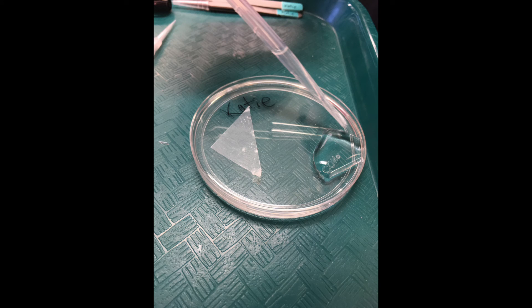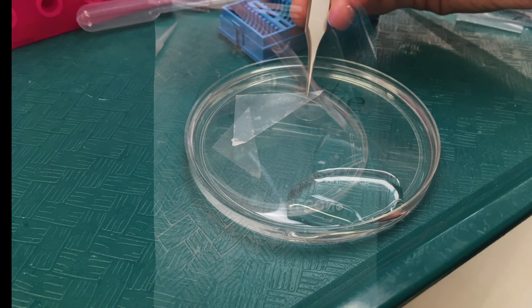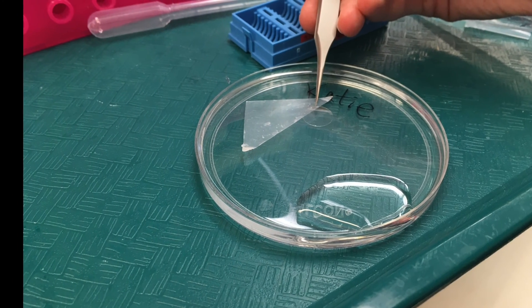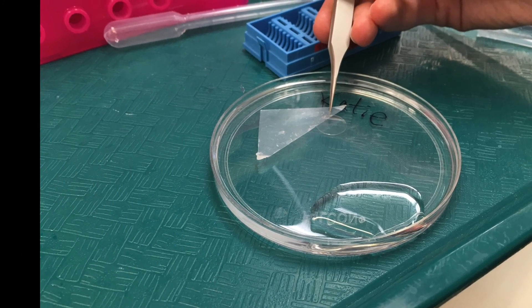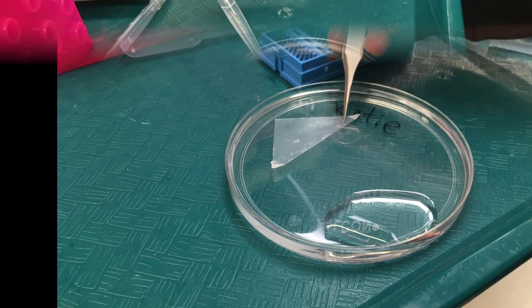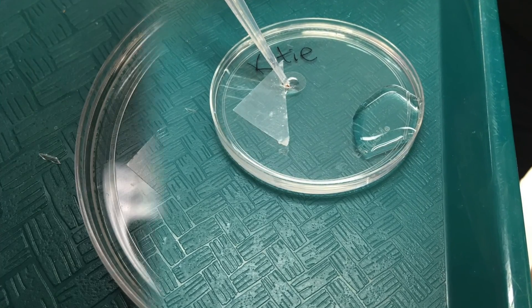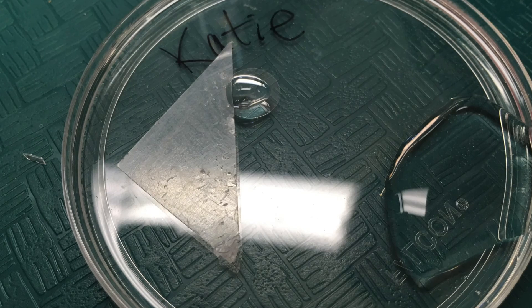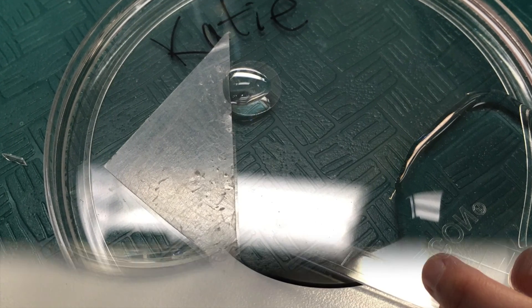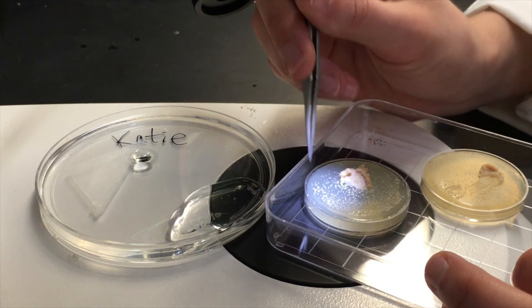First, pipette a pool of saline solution onto your dissecting dish. Then place a cover slip down with one edge along a piece of parafilm for easy removal, and add some saline there as well. Now you're almost ready to dissect.